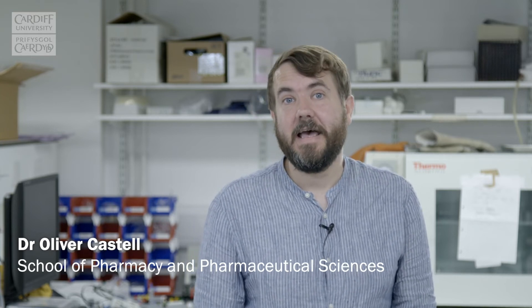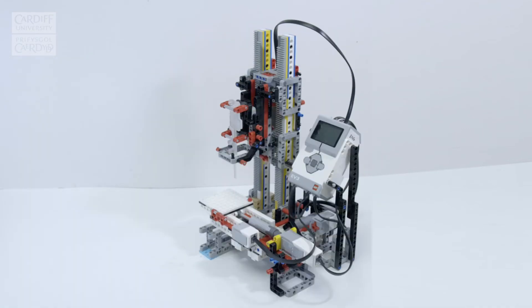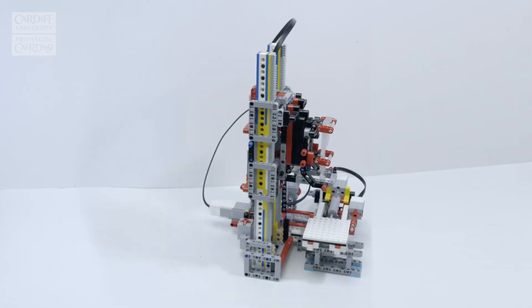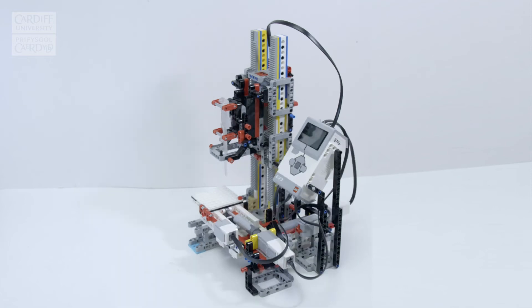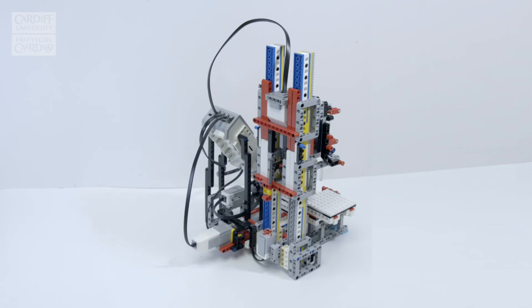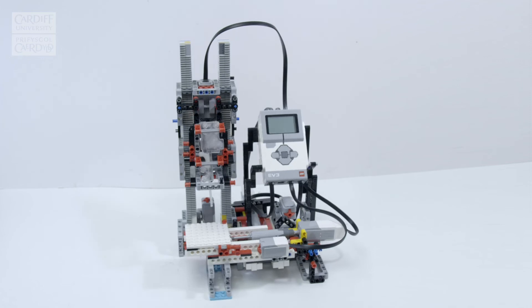Lego is a very versatile construction toy, but it's manufactured to very high precision and high tolerances, so you can build things with very high reproducibility from one build to the next — surprisingly high, actually. It's readily available and it's cheap. We also thought it's something that everyone is familiar with, so students who are not necessarily familiar with engineering can get their teeth into building a machine and a robot out of a material they're already very familiar with. This enabled students across a diversity of backgrounds to contribute to building and evaluating this printer.